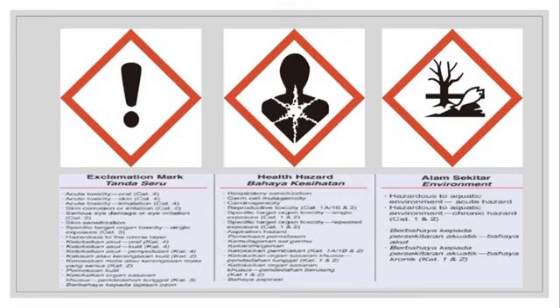Okay, next is the exclamation mark. Fifth is health hazard, for respiratory sensitization, germ cell mutagenicity, and carcinogenicity.